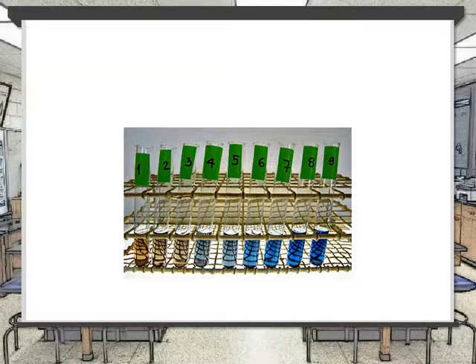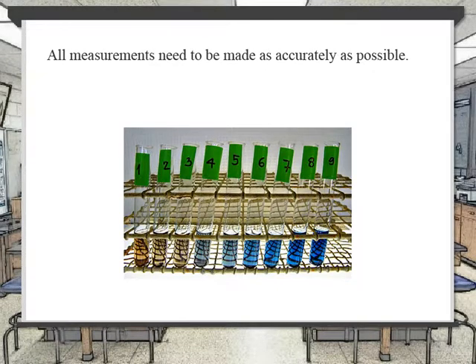It is very important that you make sure that the cuvette is in the proper orientation. This is because this direction, or the way that it is oriented, will affect the reading that this instrument produces.